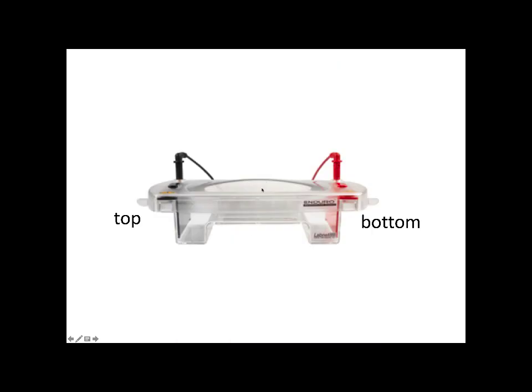With gel electrophoresis, you should know how the charging works. At the top, we are going to always have the negative charge. At the bottom, we'll always have the positive charge. That's because DNA will move towards the positive end. DNA molecules that are larger will stay up at the top. DNA molecules that are smaller will move towards the bottom. Again, we add a dye. You can see some of that dye right here. Also, this sort of blue line right here is some of the dye. Those are visible always when we look at the gels. However, getting this glowing band pattern is only available when we add the SYBR Safe.